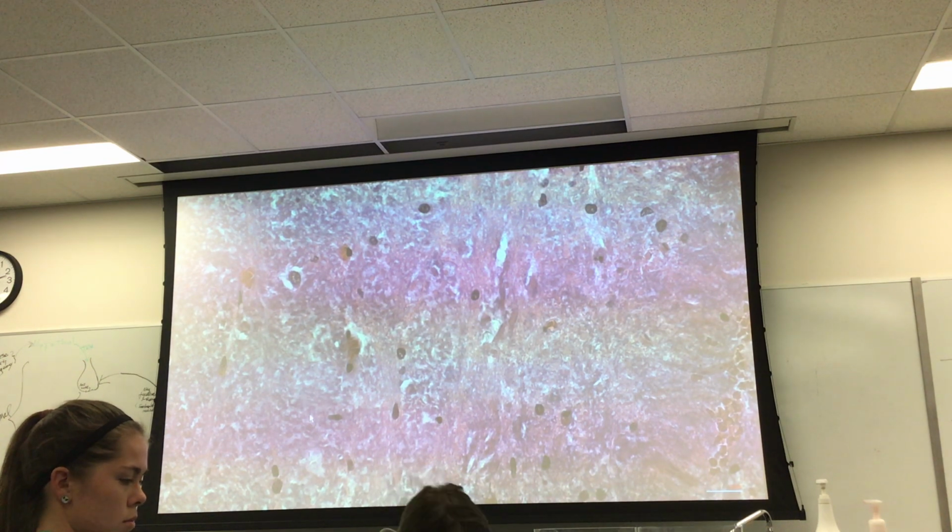The muscle types, the one thing that we didn't do is skeletal muscle in cross section, which is really pretty simple, I suppose, because of the nuclei. Smooth muscle cut in cross section, you're always going to have the context because it's next to longitudinal muscle.